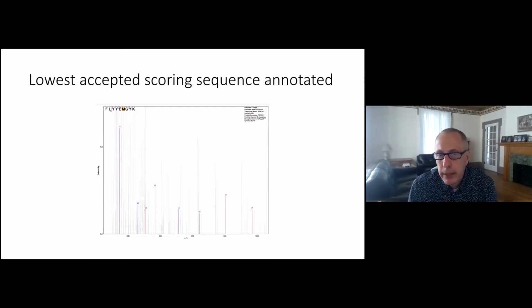It's still a pretty good identification. It's not uncommon for this because we have a bit of a length problem with the MetaMorpheus score. Since we just count fragment matches, short peptides are somewhat undervalued, because you can only have 2 times the sequence length in total possible matches. But anyway, we have a very good Y-ion series here. This is really quite excellent. The fact that we only got 1 B-ion is not unusual, but you can see the intensity of these fragments is severely diminished, and that there are a lot more gray peaks in here.